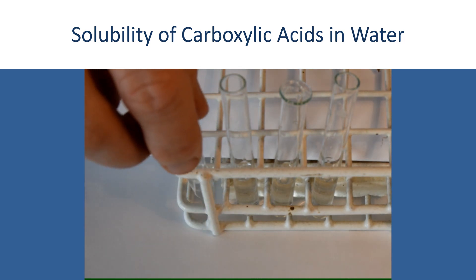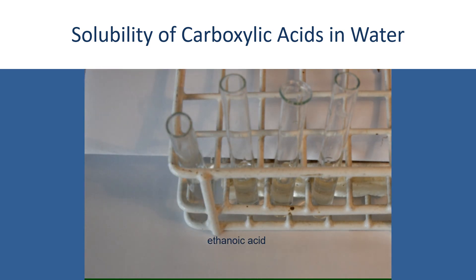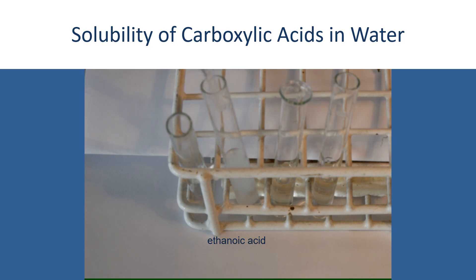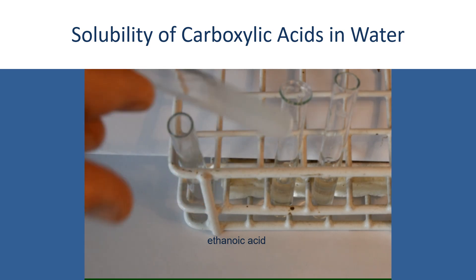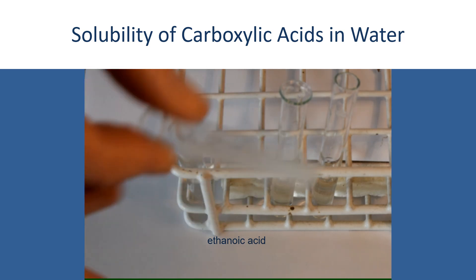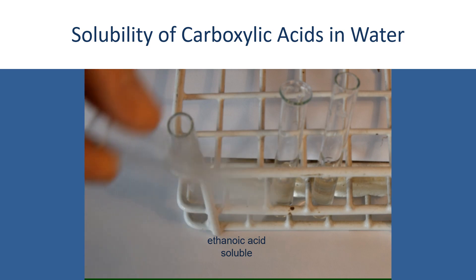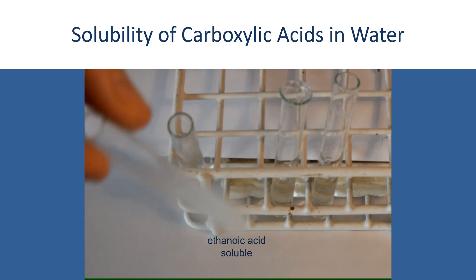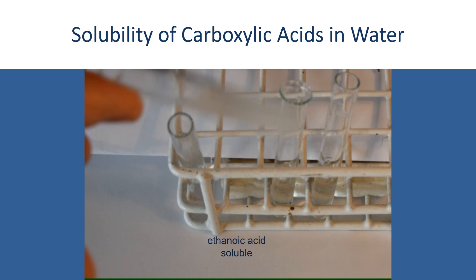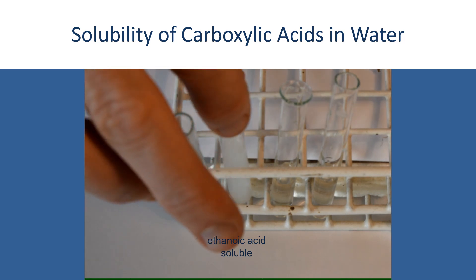Next, I'm going to go to ethanoic acid, which has got that smell that you recognise as vinegar. If we take some ethanoic acid and add it to the water, you can see that it becomes a bit cloudy. If I give it a bit of a shake and then leave it, that cloudiness will disappear as the ethanoic acid becomes completely soluble in the water.